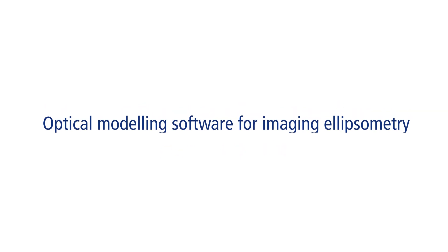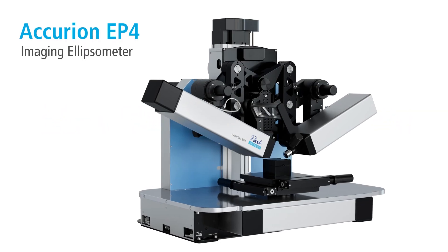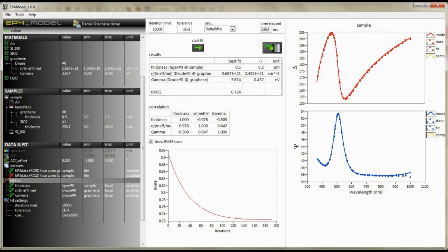Introducing the new EP4 model, a powerful modeling software tool for calculating ellipsometric data to thickness and material-specific dispersion parameters.